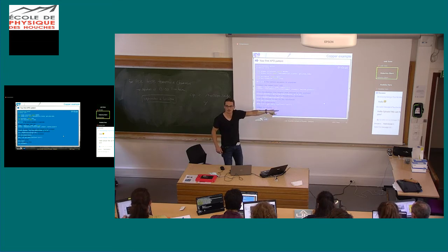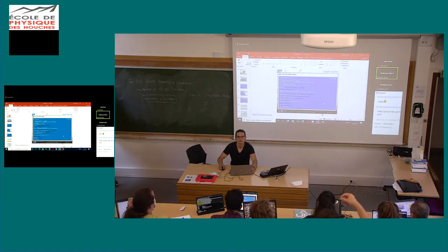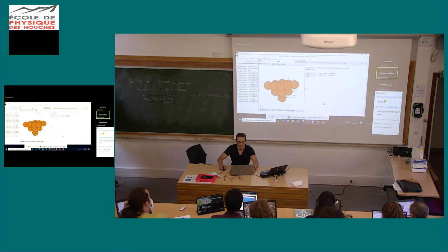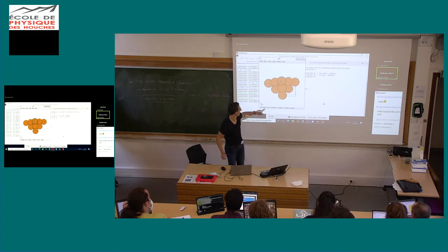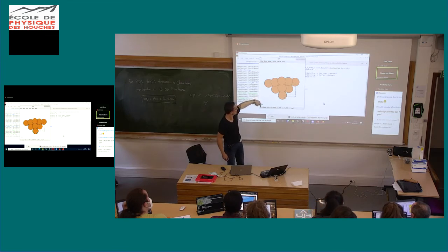Is that clear? Not too much? Okay, so this is just a number here. Sorry, graphically, how can I check which is the index? Okay, I will show you. This is the cluster. If you click on an atom, you see its coordinates. It's tagged, and this is number 4. And you used the hemispherical function, so you chose to locate the absorber at the bottom, so it is at 0, 0, 0, and this is number 5.